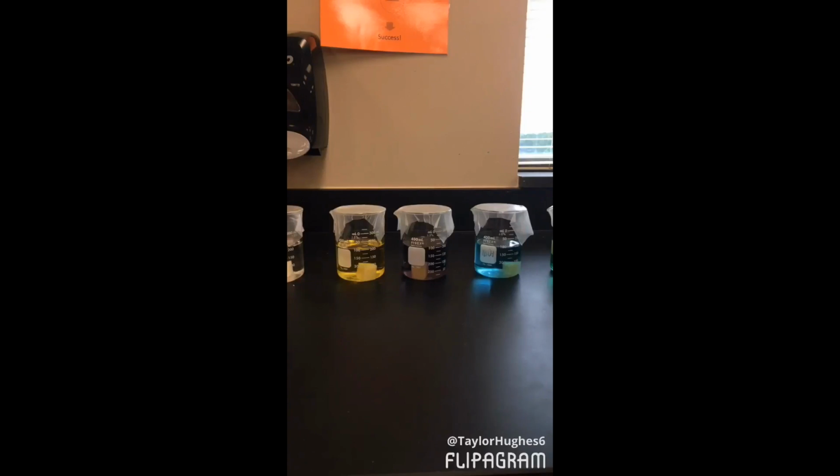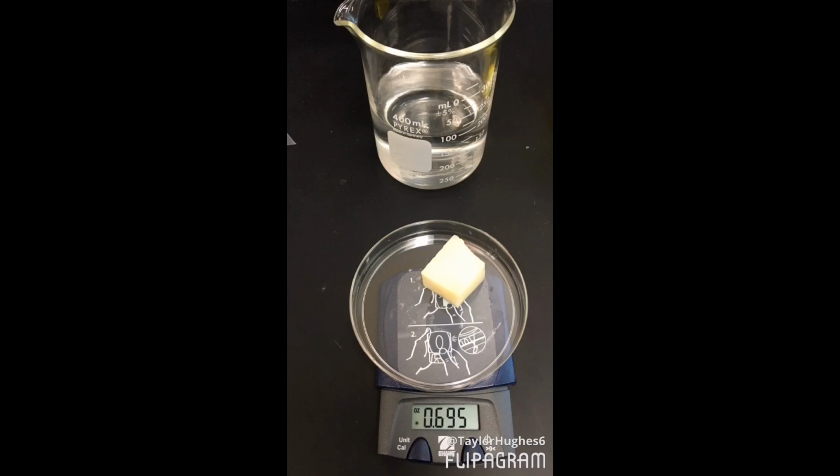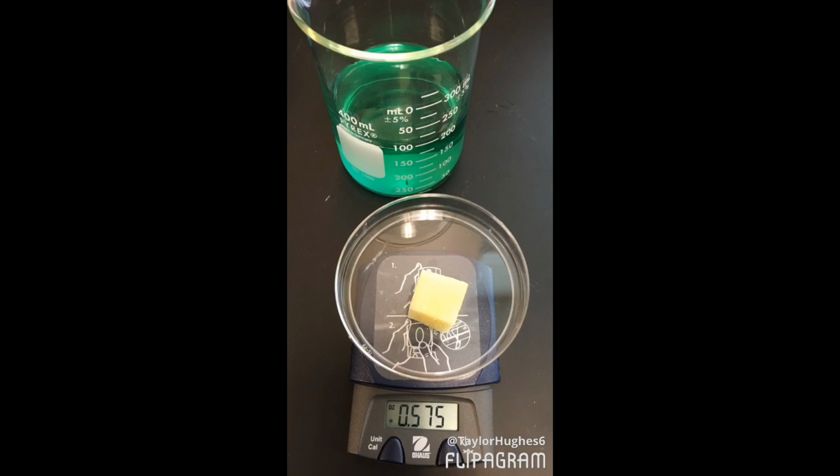After letting the beakers sit overnight, we weighed them all again. We were hoping to compare the previous weight with the new weight the next day. We took more pictures and more visual observations were taken as well.